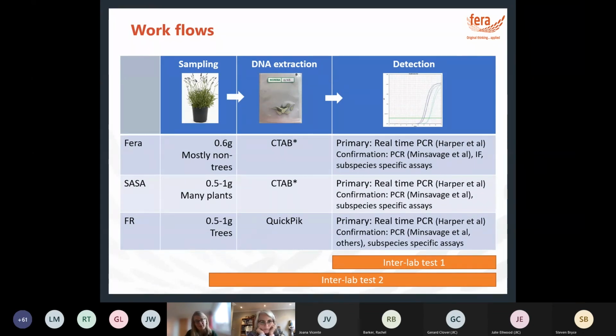If we had a first interception, or if we had an important sample, we'd have to do confirmatory testing on it. And we're all using the same sorts of second line testing, so conventional PCR. But we were all in agreement that if we had that first interception or that very important sample, we would probably use every single tool we have to examine that sample as much as possible.